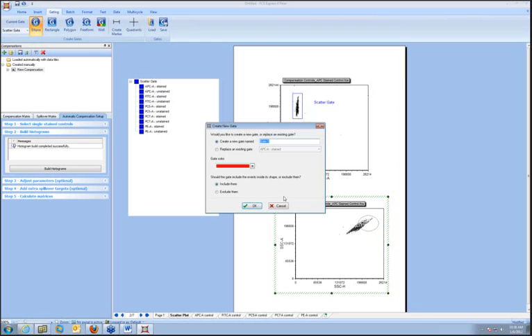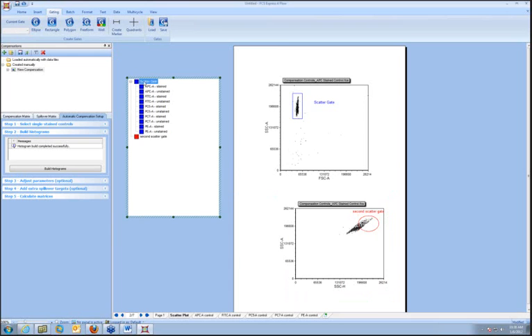So you can see here now that still everything will work fine because all of the gates that we had are children of the scatter gate, which is now a child of the second scatter gate, and all of the plots on the other pages are gated on the scatter gate. So they'll still all be updated based on the second scatter gate. Okay, so I'm not going to go over how gating hierarchies work. If what I just showed doesn't seem to make much sense to you, please see our gating webinar or our tutorials on gating and gating hierarchies, and that will make a lot more sense. But after the histograms are built, before you calculate the matrices, you have the flexibility to adjust your gates in any way that you want. And of course, you can recalculate the matrices as many times as you like.